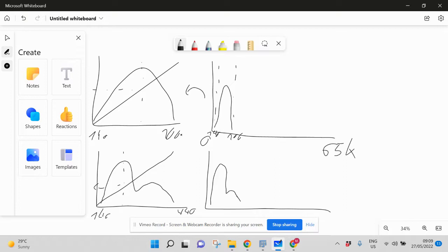What we want to do instead of having each image use its own minimum and maximum is to use the same minimum and maximum for all images. Specifically, we want the maximum of around 440 applied to both images, not just the one with the brightest cells.